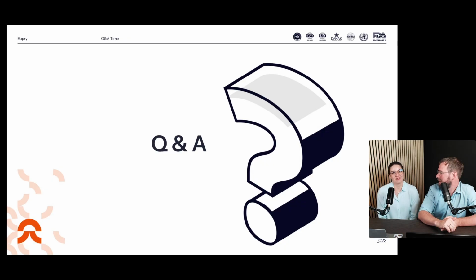Yeah. I guess a point where it could make sense is that if you see a large deviation, it's very likely that if you try to change the set temperature after a while, it might be totally off. And it's also recommended by the guidelines that you place a sensor next to the control sensor in order to roughly verify that the temperatures that the air control system sees are actually also the temperatures in there.